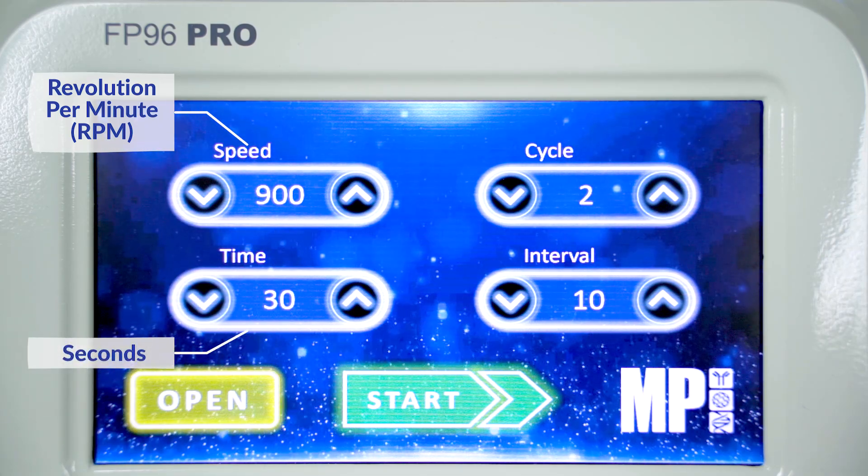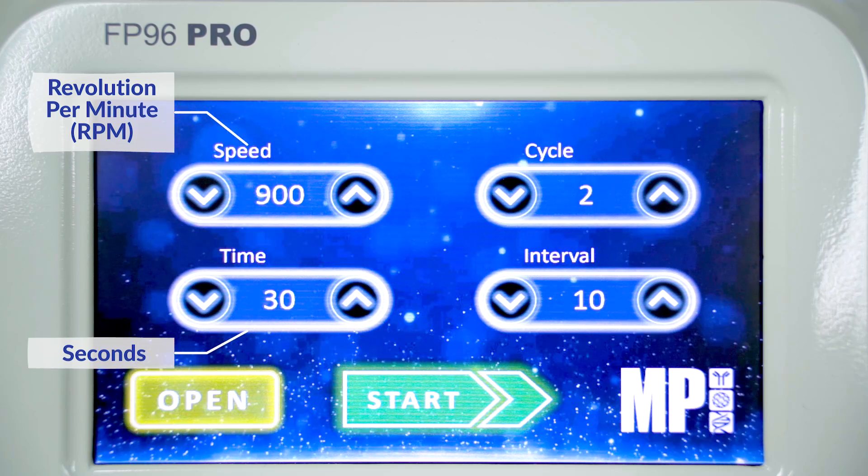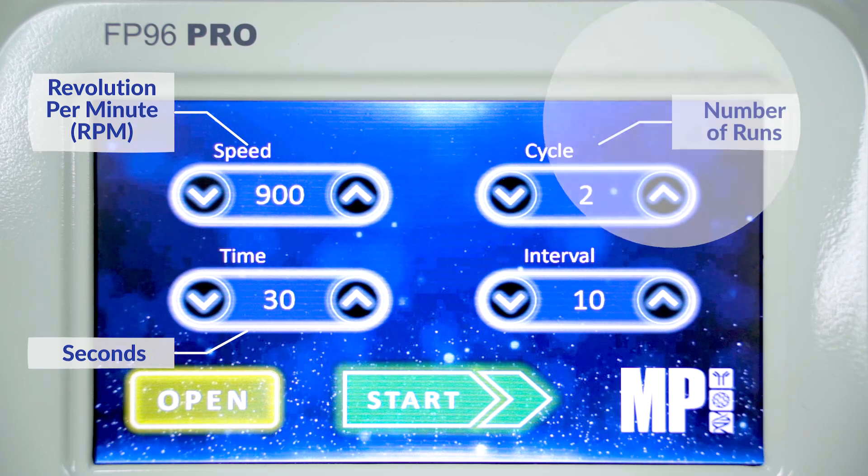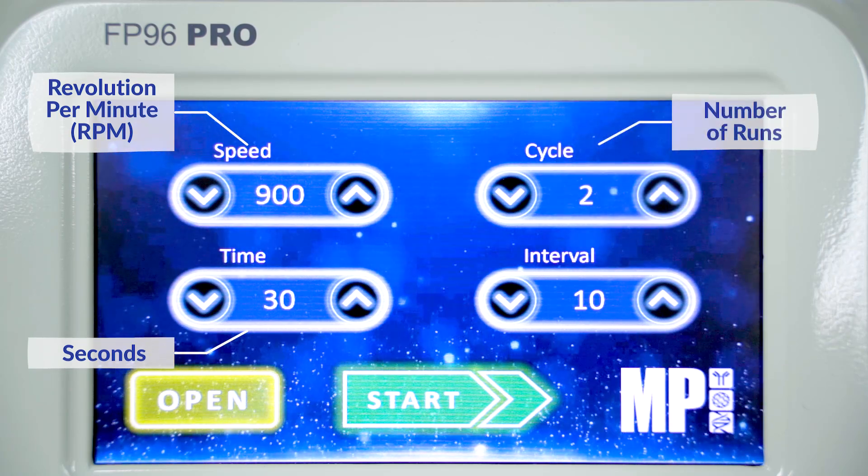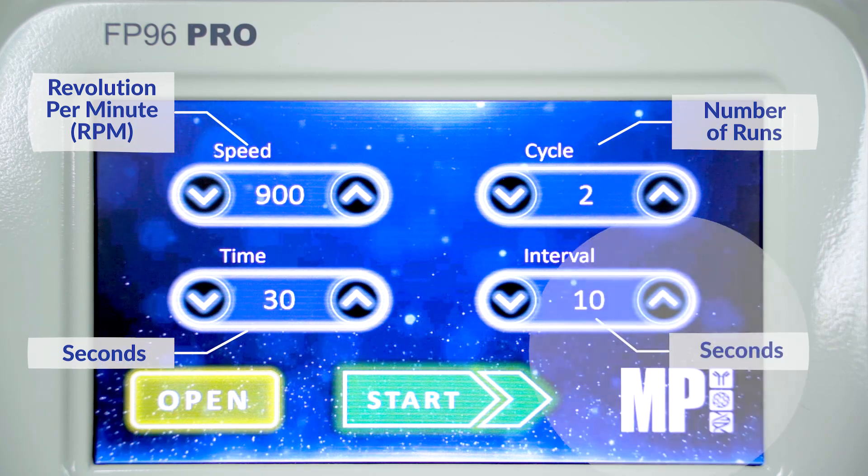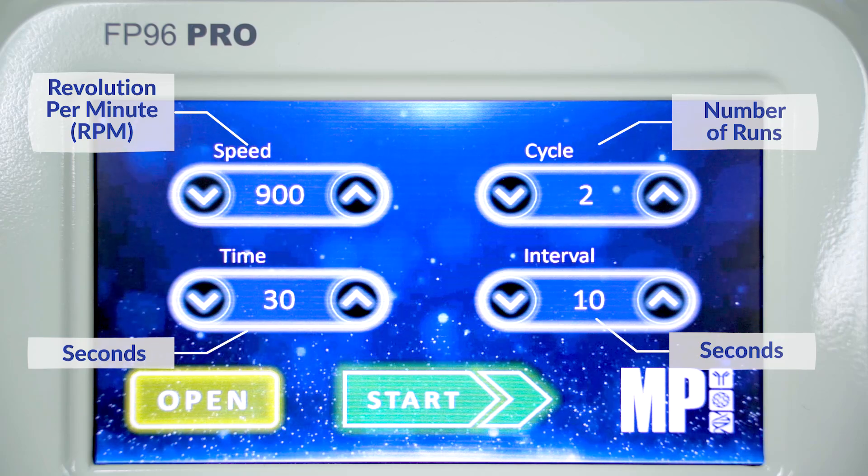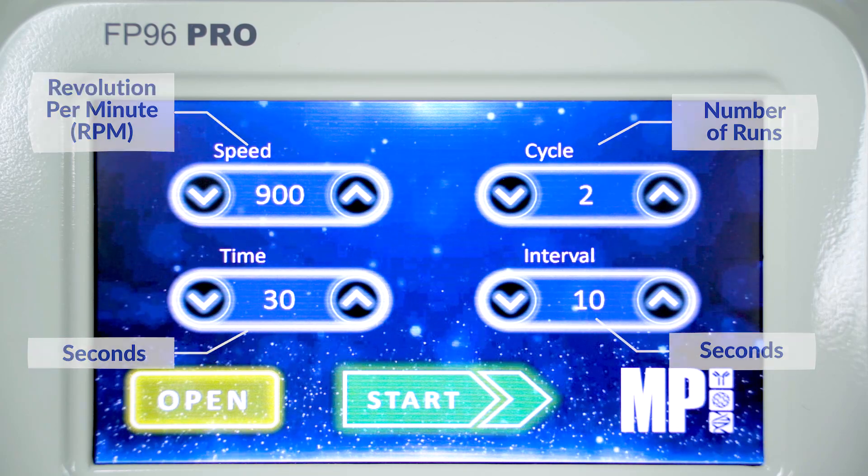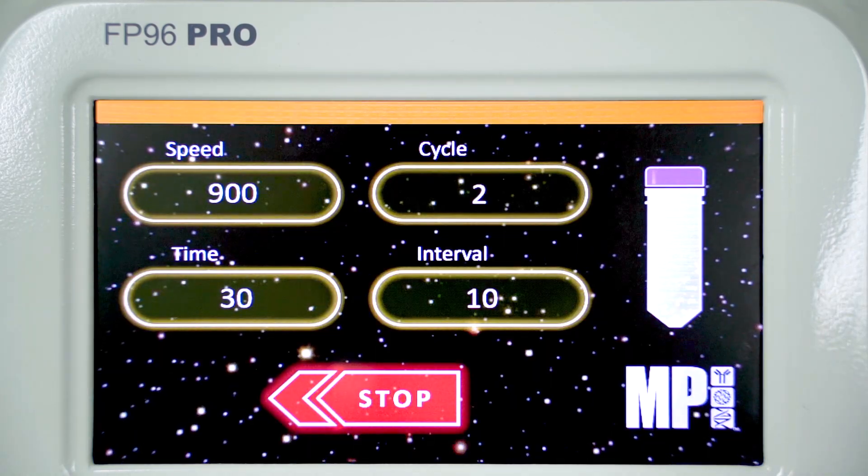Use the up or down buttons to set the desired speed and duration of the run. For multiple cycles, you can press the cycle up or down buttons to adjust the number of runs. The interval button can be adjusted to set the duration of the pauses between each cycle in seconds. Once all parameters are set, press the start button to begin the homogenization.